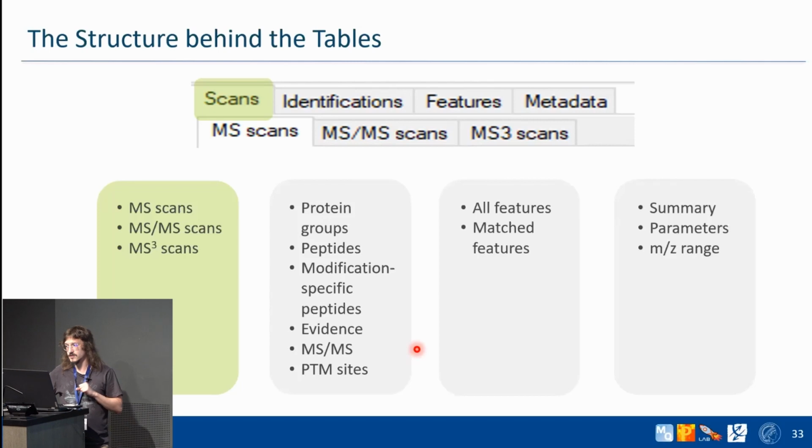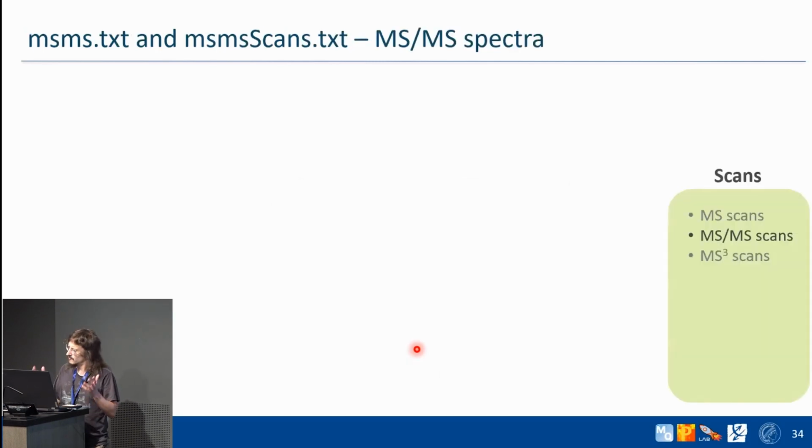You can look more into your data. And this is probably something that you may use if you're more interested in the experimental setup of the mass spectrometer. Unfortunately, as I said, I'm not very much an expert about mass spectrometers, actually not at all. So probably you will know more about these specific things than me.